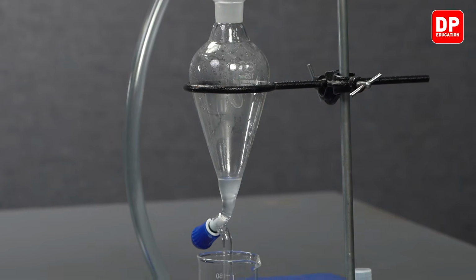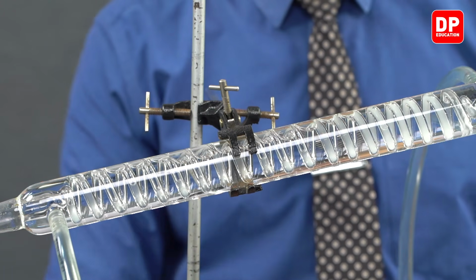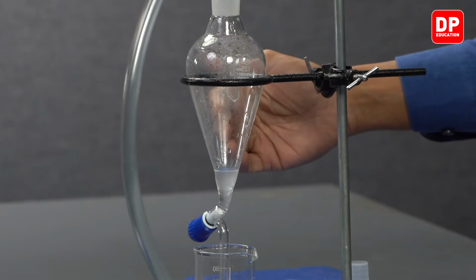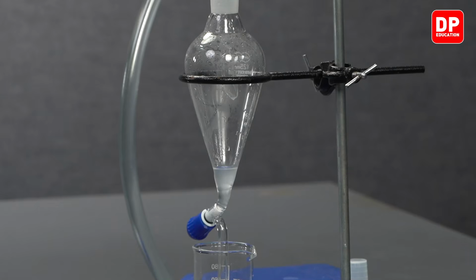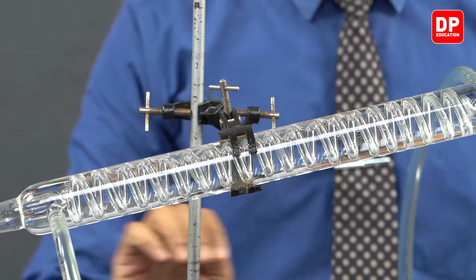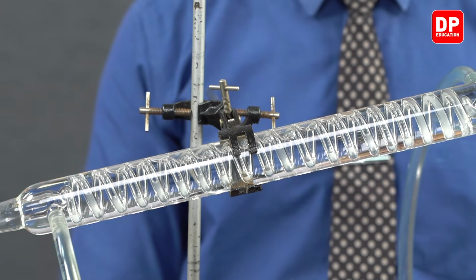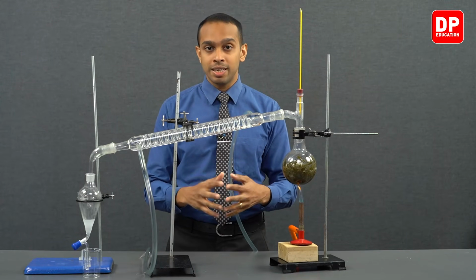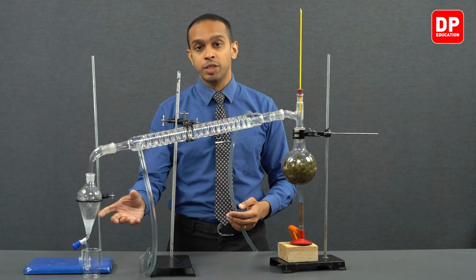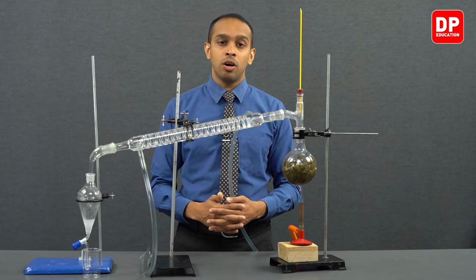You can very clearly observe the condensed vapor in this area, and it is filling up the rest of the condenser as well. So slowly you can see again a small amount of liquid got collected over here in the separatory funnel. Please observe this condenser. You can see how it is slowly moving the liquid to the bottom of the condenser and out of the condenser into the separatory funnel. Students, we will allow this setup to run for a few more minutes, and after we have collected a sufficient amount of this liquid mixture, we are going to move on to the next part of this experiment.